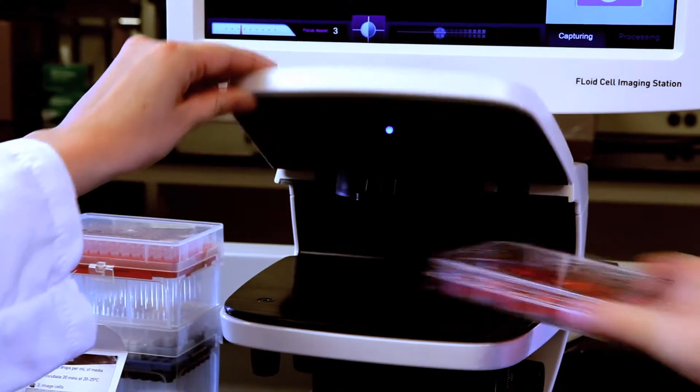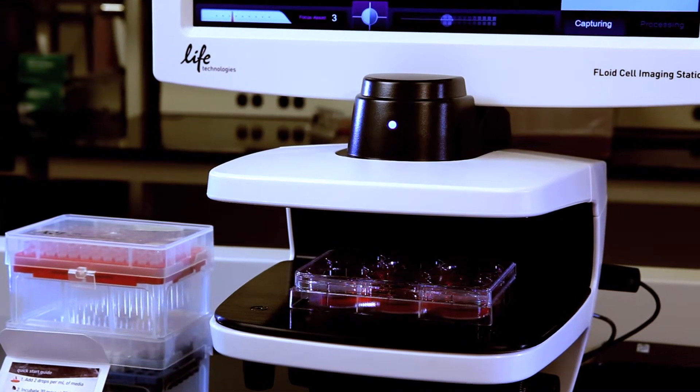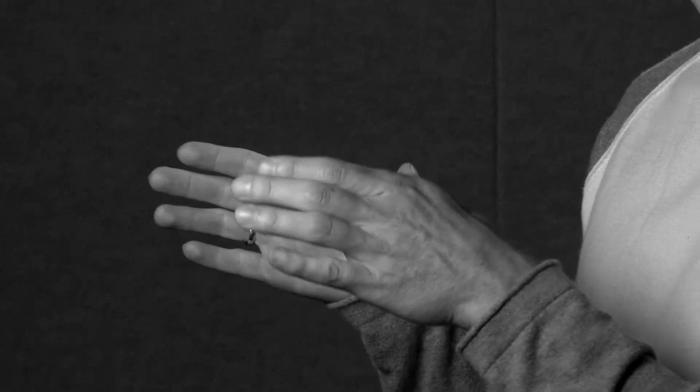Something you have to work around on fluorescence microscopes is the stage — they either have inserts or they won't accept everything you bring to them. You have to place the sample in something compatible with the stage. With FLoid it was built to take everything from slides to tissue culture dishes to flasks. We made the stage accommodate all types of sample vessels and also allow you to very intuitively move your sample around in very small motions.